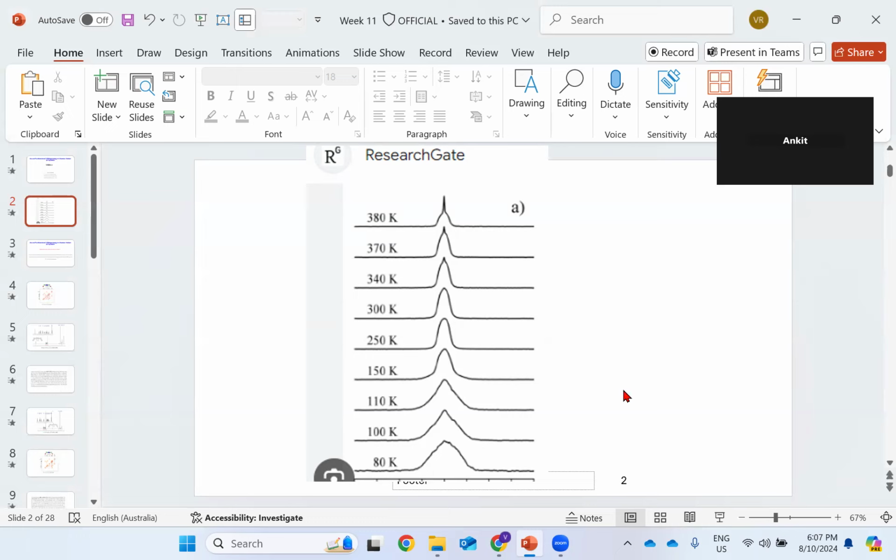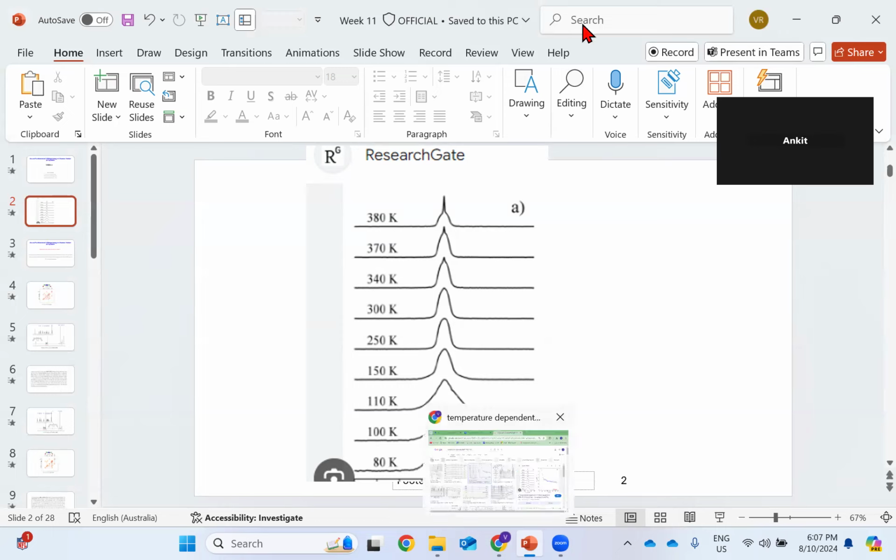It's kind of multiplets. Also, if you look at the temperature, in some spectra, like the peak due to the OH bond of the water molecule, we observe a slight shift in the spectra with the temperature. I will just show the spectra of chloroform at different temperatures.